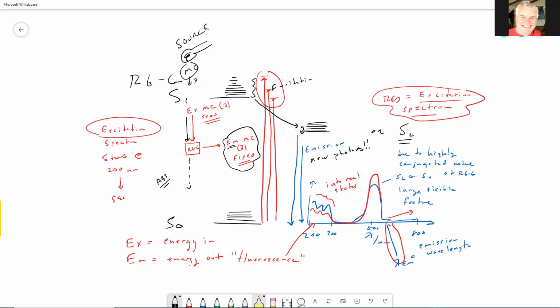Now I'm going to ask you again, Sue: are these emitted photons the same photons that were from the source?